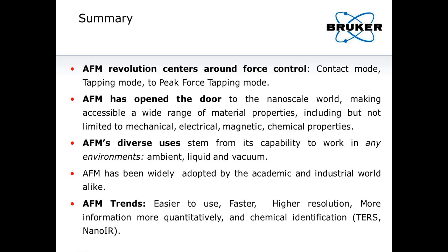Another one for polarity is probably piezo response force microscopy. Let's say you have different piezoelectric domains on the surface, and you have the tip on the surface. If you apply an alternating voltage to it, it's like a piezo. That domain may respond to the electric field to expand or contract, and you can tell the polarity there as well.